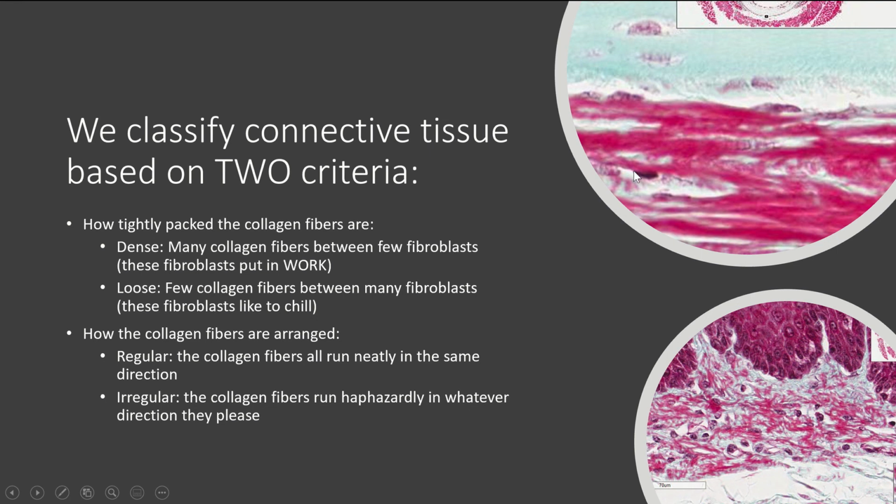Sorry. So you can see here, this one little fibroblast, you can see all of the little collagen bundles, okay? Within here, and we'll look at ones that look really regular and all the little collagen bundles are running neatly in the same direction. Here you can really see they are not at all running in the same direction, right? They are going crazy in here. So that is irregular. Okay.